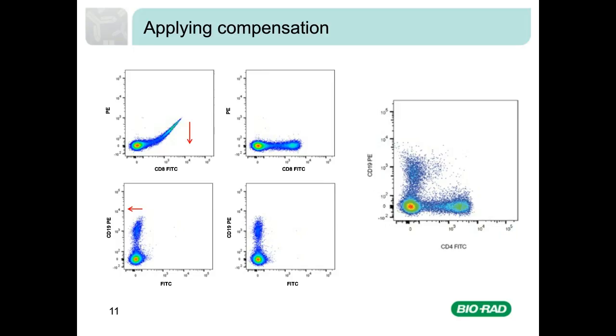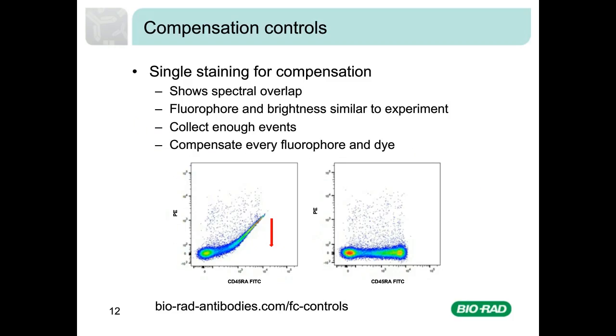This slide, taken from my recent flow cytometry controls webinar, shows what controls you need to accurately apply compensation. Compensation controls are samples singly stained for a fluorophore, so you can detect the spillover into other channels. Quickly to recap though, there are some important things to consider when using single stain samples.